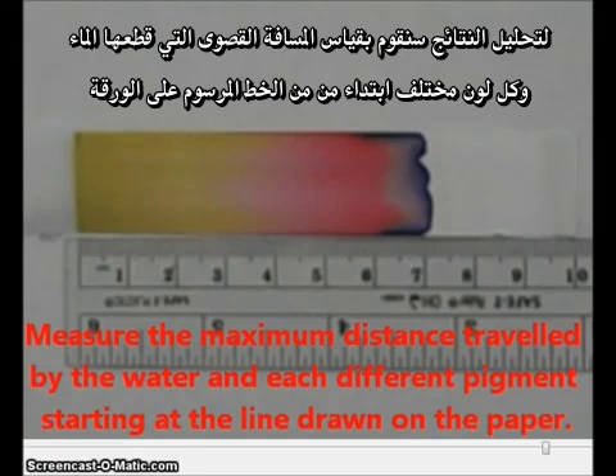I want to measure the maximum distance traveled by the water and then by each different pigment, starting at the line drawn on the paper. To be fair, we should be comparing the distance traveled by the water starting from the same point where the pigment started traveling. We'll measure all of our distances starting at this point.